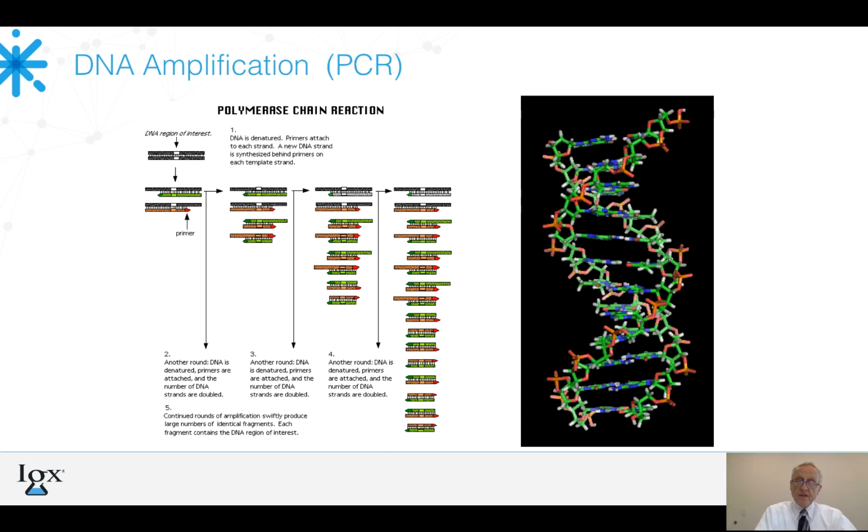and only at those specific sites. So we're looking for the DNA of a bug, which is super specific. We're cutting it up into pieces that are absolutely specific only to that bug so that they don't cross-react with possibly other species or even organisms that aren't causing, in this case, Lyme disease. And you want to make sure you are able to multiply those out. So you use very specific, what we call primer sets.